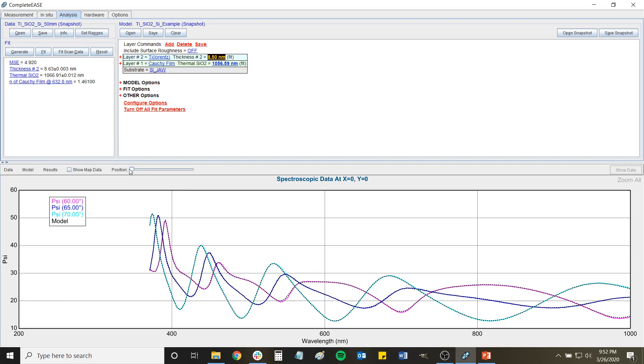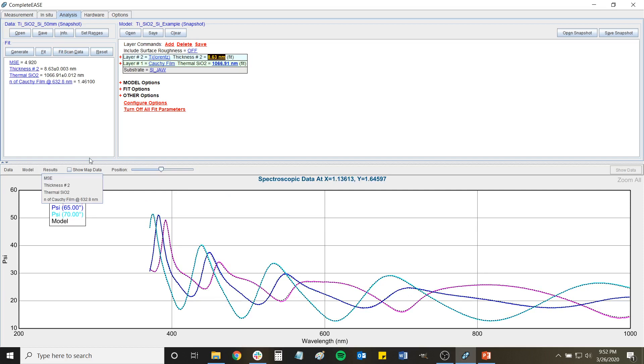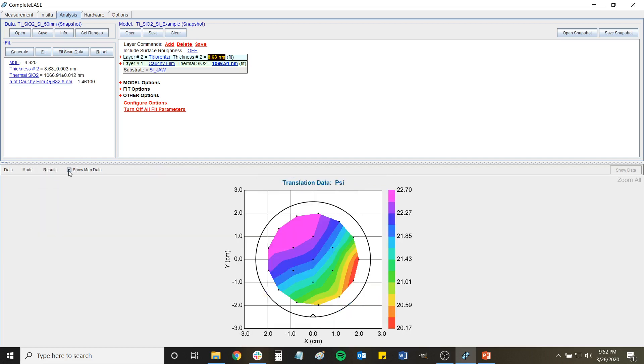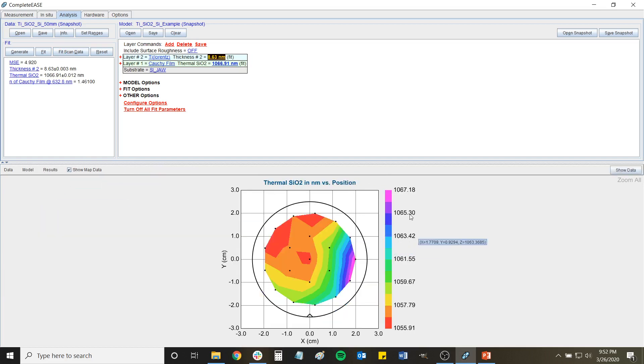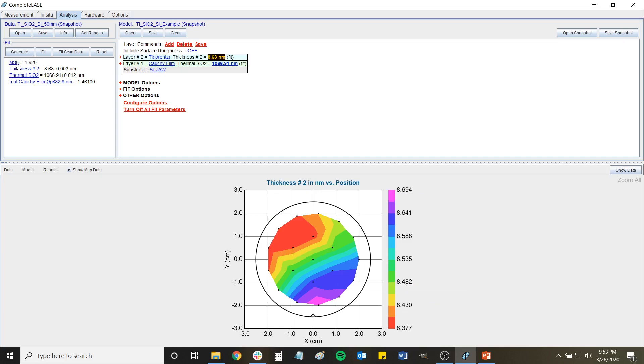So like fitting any map scan, I can just hit fit scan data and then show map data and then look at the results. And I can look at my SiO2 thickness and I can look at my titanium thickness, and you can see it's a pretty small range. The error is decently low.